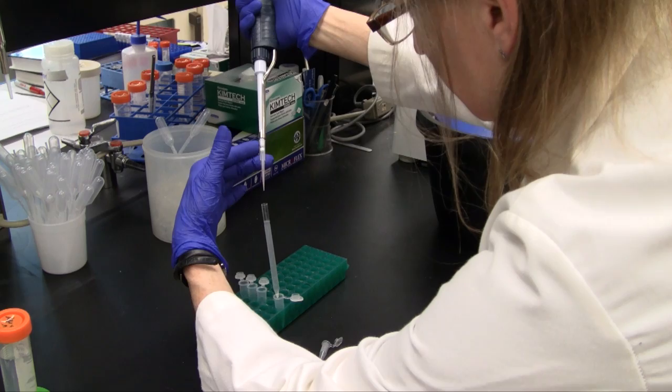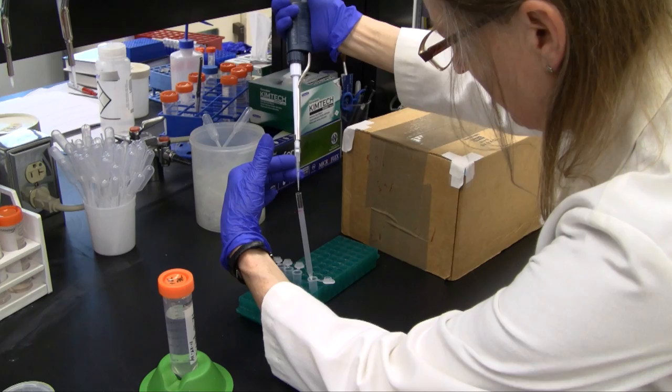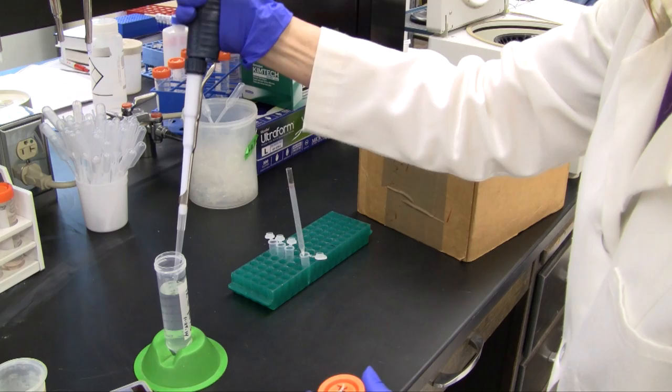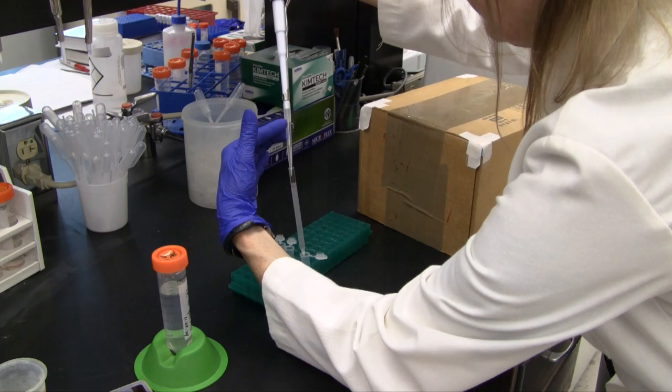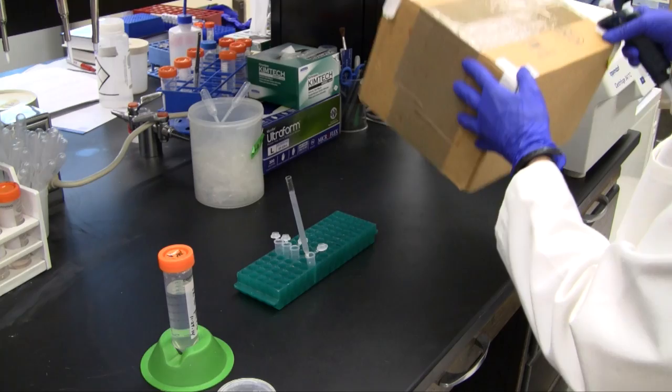After 1 minute, 50 microliters of TE is added to the top of the column and allowed to enter the gel. 350 microliters of TE is added to the column and allowed to drain. At this point, the column is inspected to ensure that the probe can be visibly identified as moving through the matrix. The column is then moved to the first of three 1.7 milliliter tubes for elution.